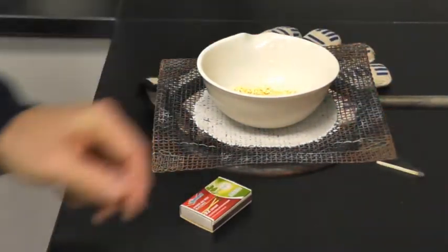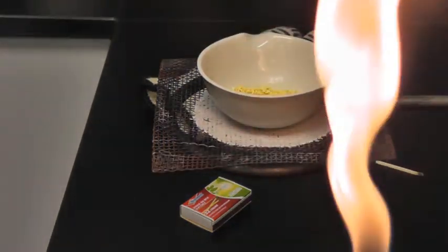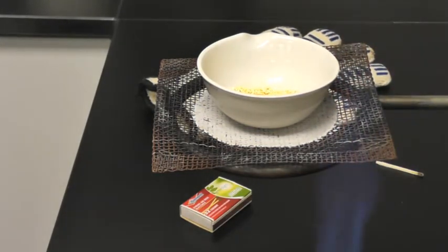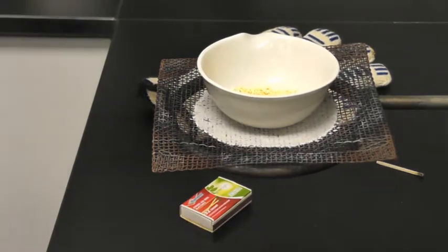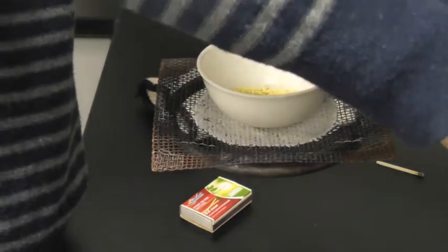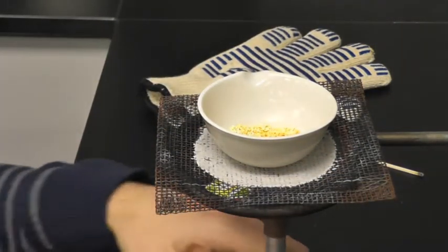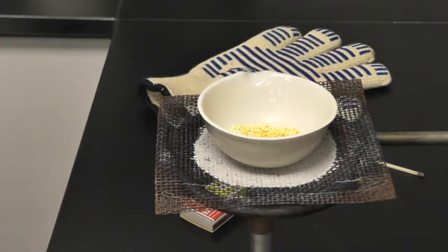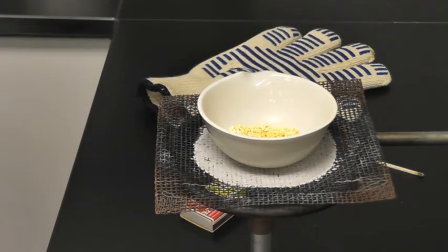Heat, like flame heat, is hotter than electrical heat in most instances. So I'm going to change this to a blue flame, and hopefully have this about so it's hitting the bottom. I'm going to lower this a little bit before it gets hot. There we go. So now we're just going to heat it again for about 5 minutes under really strong heat, okay? And hopefully that's going to drive out the rest of my water and my gas.